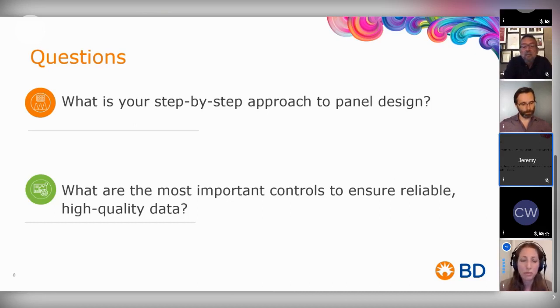If you're looking for activation and everything is negative, it might be that none of your samples react to whatever you're testing, but you're not 100% certain that you actually added everything correctly, that everything's working correctly. So you want to have that positive control. Again, let biology drive your decisions here and know what you're working with.